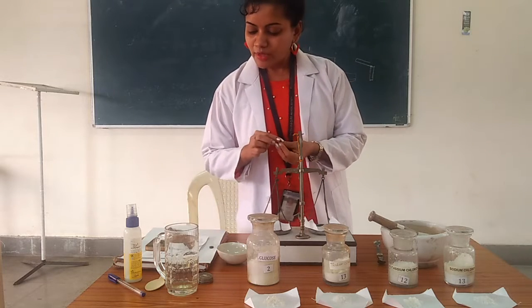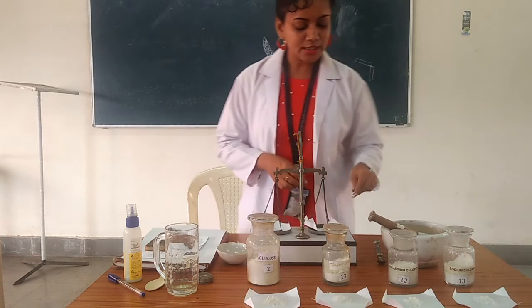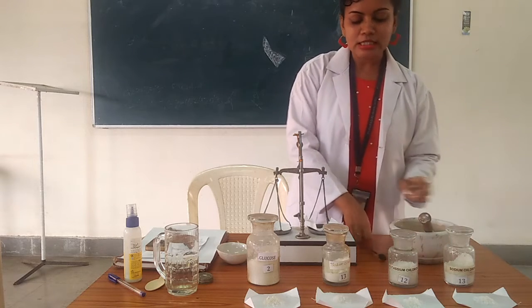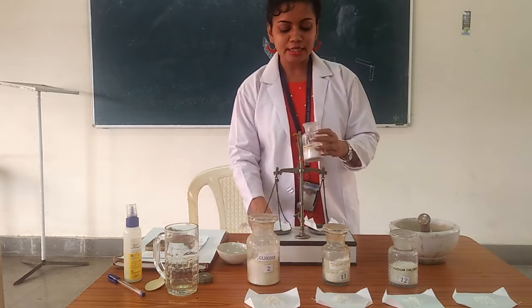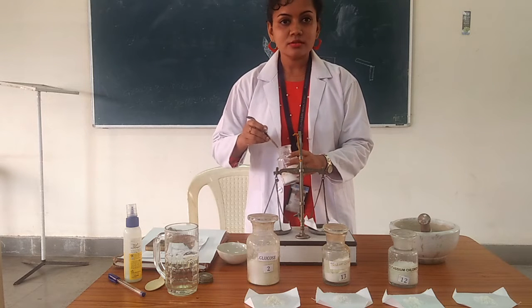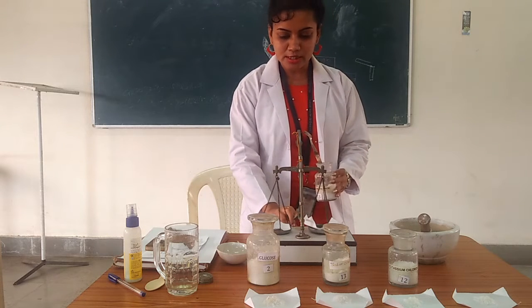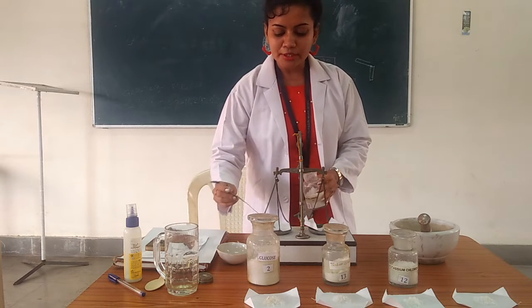Now I am going to weigh 2.6 grams of sodium chloride as our first ingredient. This is a mortar and pestle, mainly used for mixing. And this is the spatula. With the help of the spatula, I am weighing our first ingredient, sodium chloride. We add a small amount first, put it on the balance, check whether it is balanced, then add more as needed.